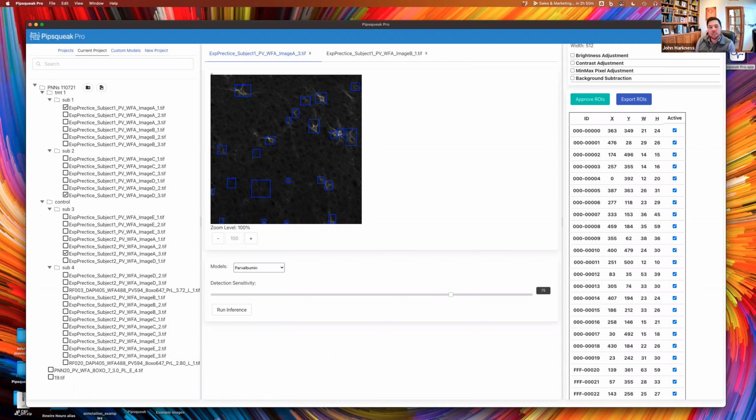As you start to customize models specific for you, your data are staying contained to your model. So this is not something that's being shared with others. And what's important about that is that somebody else's data aren't potentially corrupting your AI models. So you can feel confident in what you're seeing, that's specific and static to you.